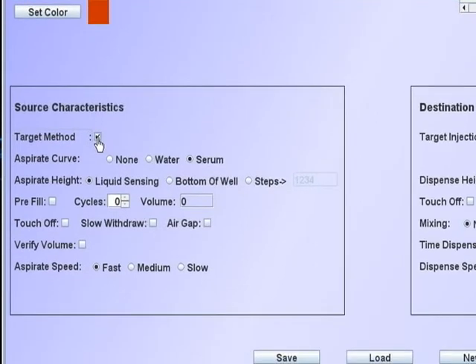If the volume to be aspirated is greater than 50 microliters, then the target method is automatically ignored even though it is checked.